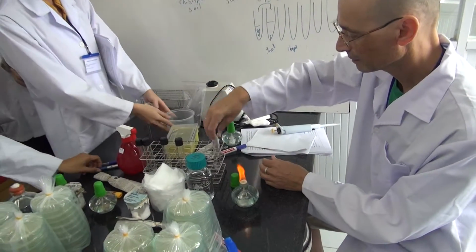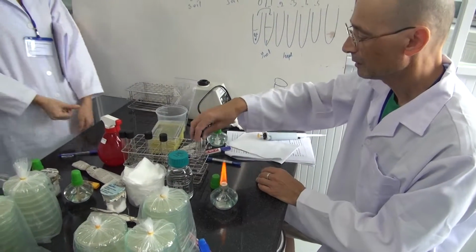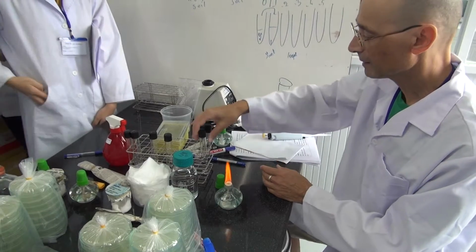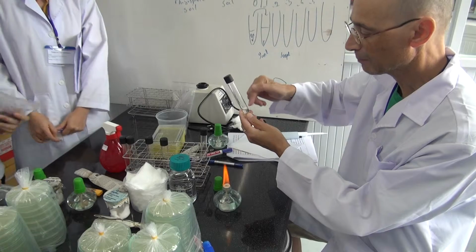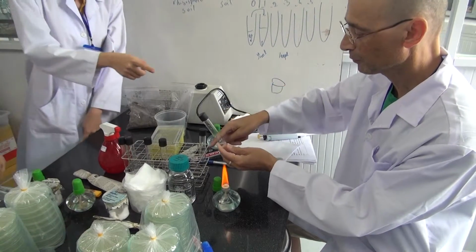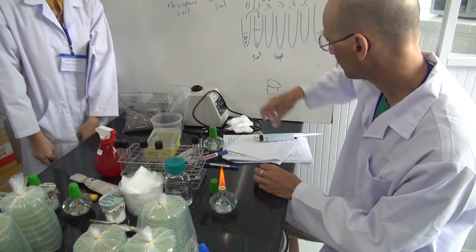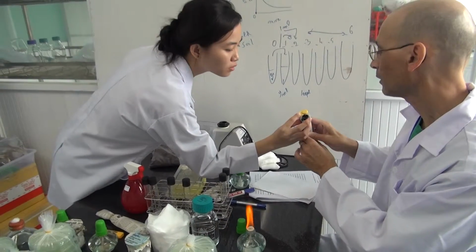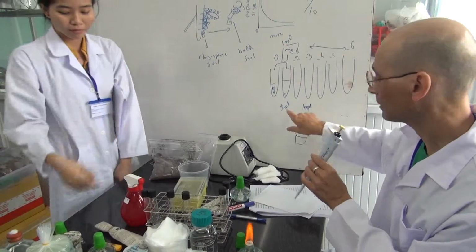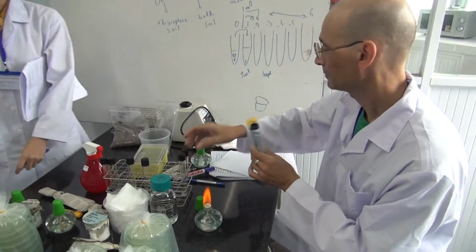And let's say that okay, so let's say that you have some sample here, and you want to transfer it here, doing a one dilution. But this is 100, but I need one. This is 9 milliliter, right? Okay.